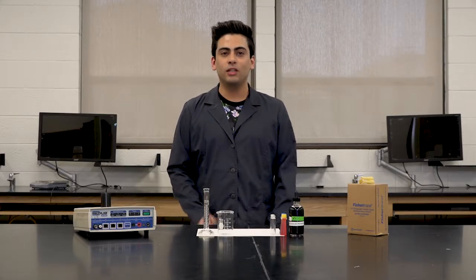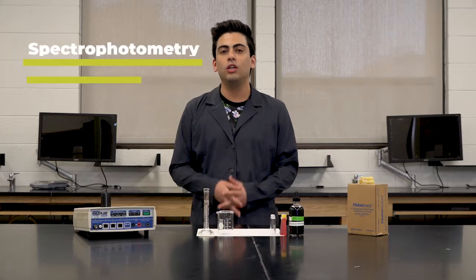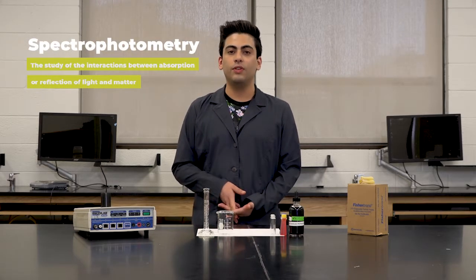Hello everyone, my name is Jesus Cantu, and today we'll be going over spectrophotometry, which is a quantitative analysis of light. Spectrophotometry involves the use of the electromagnetic spectrum. The electromagnetic spectrum consists of different wavelengths and energies ranging from radio waves, which are low in energy, to gamma rays, which are high in energy.